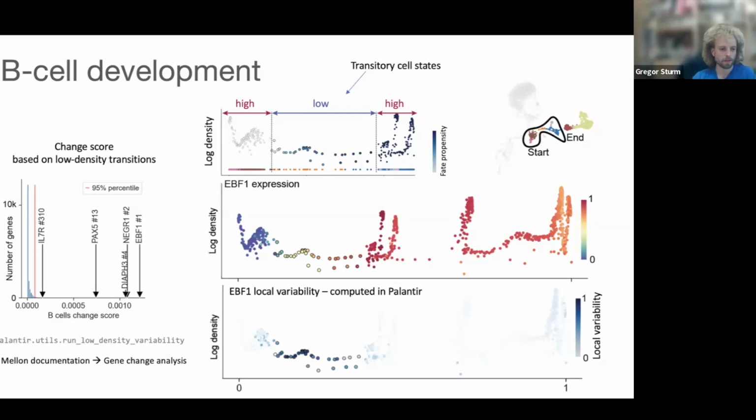In this graph that shows the log density over time, in this low density region, you have some quite large jumps between whatever cells or landmarks a dot represents. Is this a technical artifact or is this actually a signal? How can you explain this? What do you mean by chunks? You mean the amount of cells? Jumps between, but in the low density region, there is a point that is halfway on the axis and then the adjacent one above. These? No, further to the left, basically. These? So you have one dot, and then the next one is much further down, then it goes up again. Okay. You mean while there is so much noise, essentially?